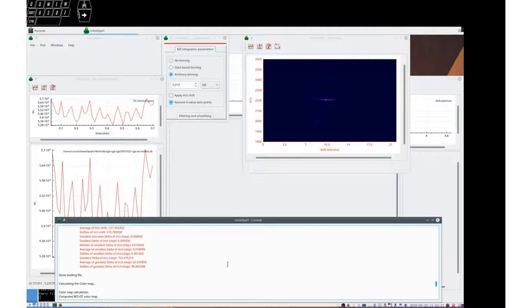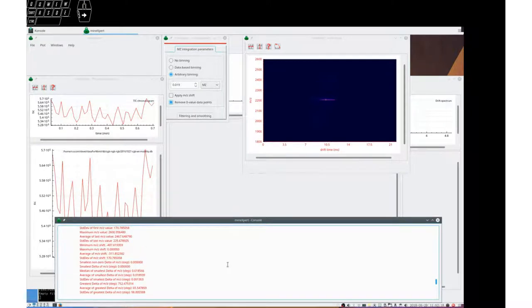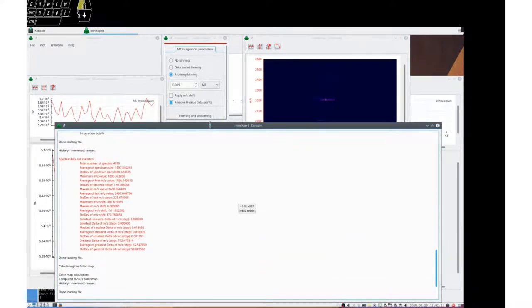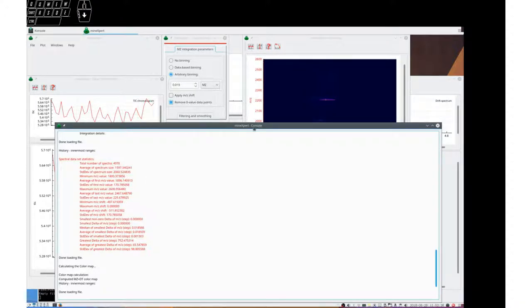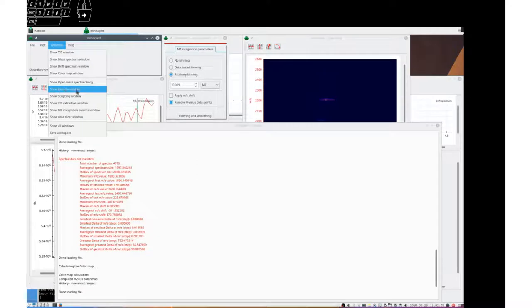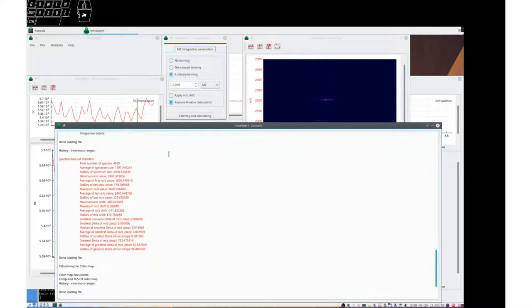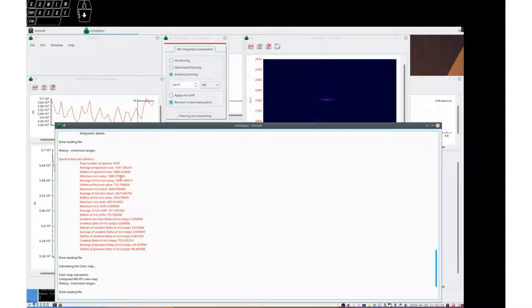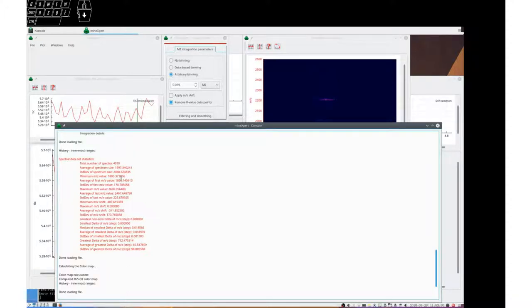When a file is loaded, some computations happen and the statistics show up in the console window that you can always ask to show using this menu. We see that in the mass spectrum file there are 4970 spectra, and the average spectrum size is 1597 data points, MZ value intensity value pairs.